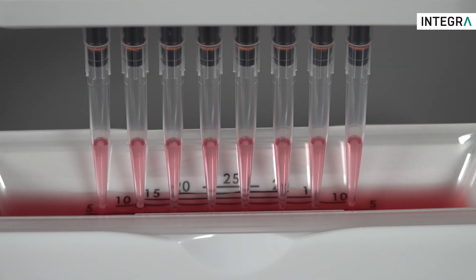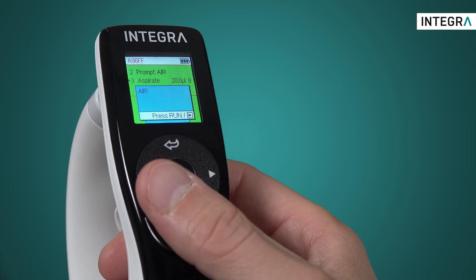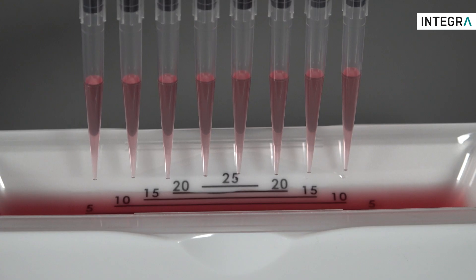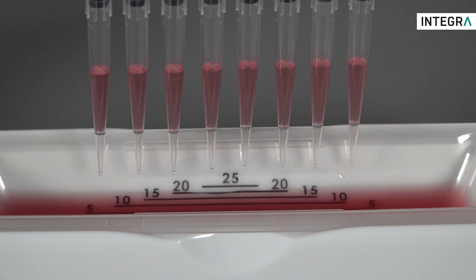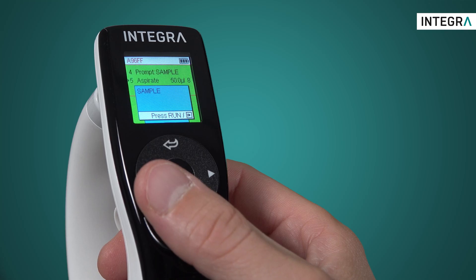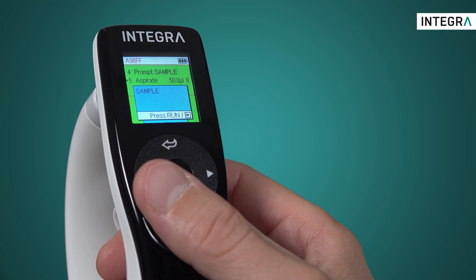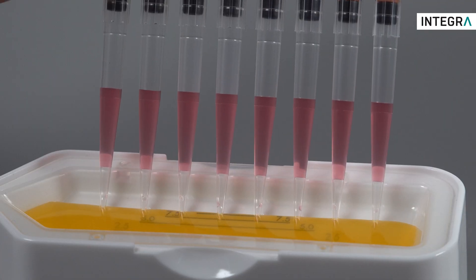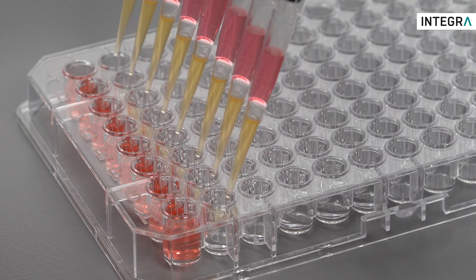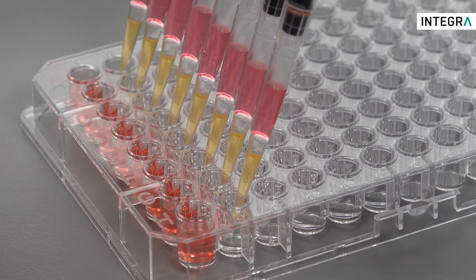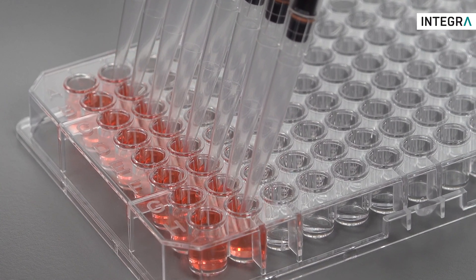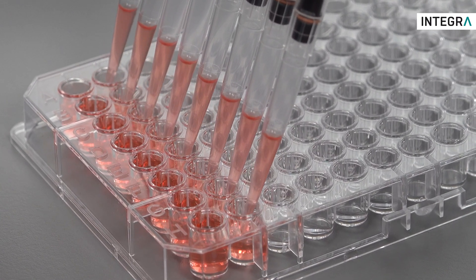I can aspirate the diluent, and looking at the screen, I see the text prompt telling me that air is coming. So I aspirate air. Now the screen is telling me that the sample is coming. So I aspirate that as well. And now I just have to dispense into my well, and the mix can begin too.